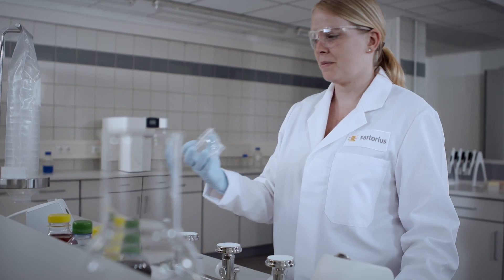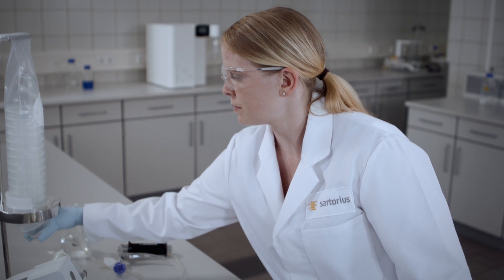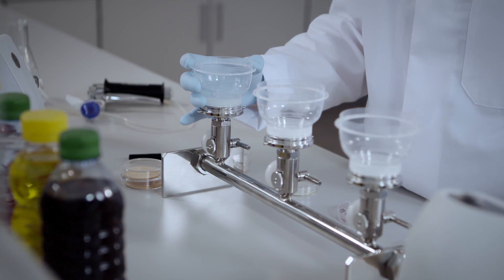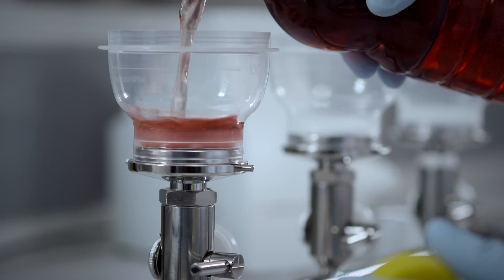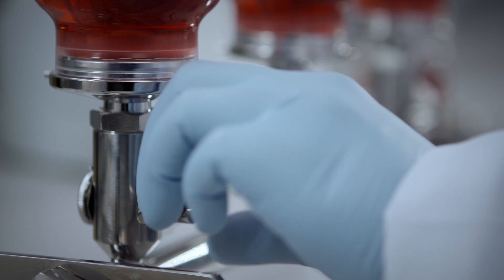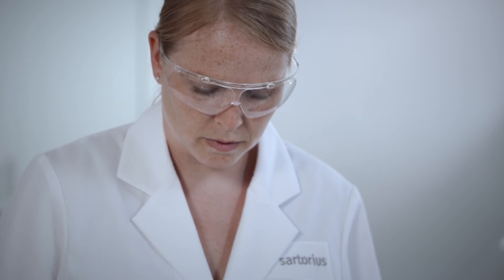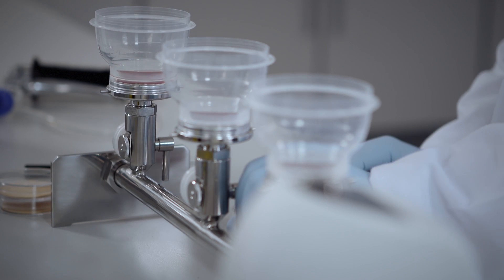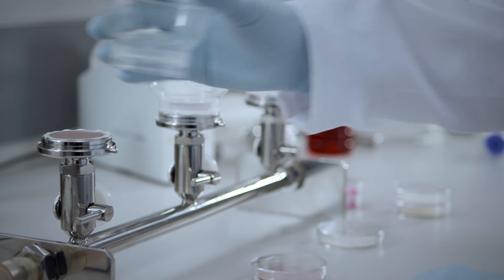A disposable funnel is the ideal combination of reliability and time-saving for the quality control of water and beverages. The Microsart funnel can be mounted and removed easily on the base support due to the innovative ClickFit fastening. The large inner diameter of the Microsart funnel ensures a high flow rate of the liquid sample. The optimized shape allows a thorough rinsing of the system subsequent to filtration with no liquid retention in the funnel. Due to the transparent funnel material, visibility of the complete filtration is given.